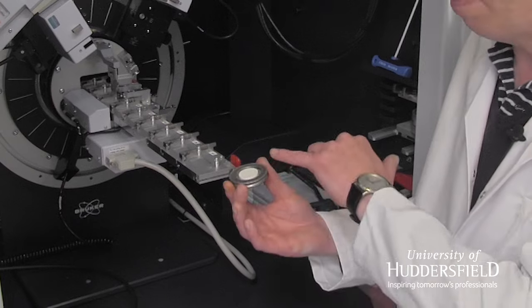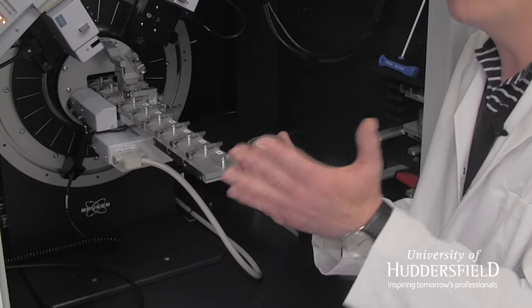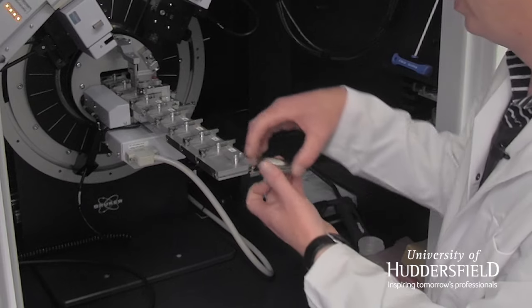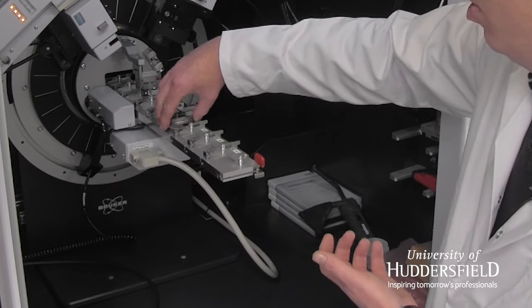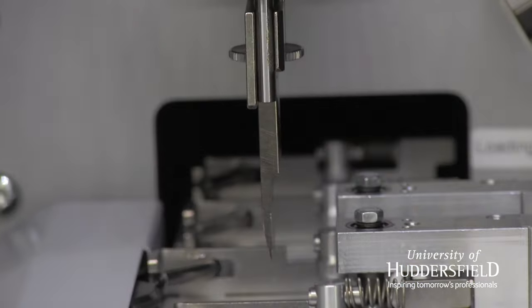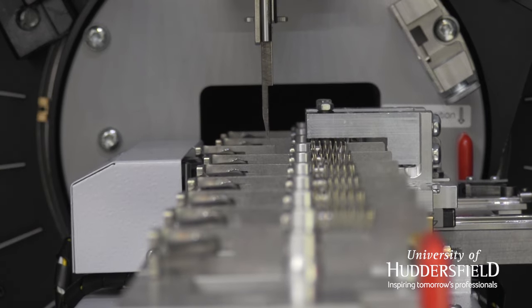What we do is we put our powder onto this sample holder, not like the other machine where we use a little crystal on a pin. We pop it in here and it just goes into the machine. We have so many auto-samplers, so we can run lots and lots of samples. And each of those samples, we can learn about the molecular structure.